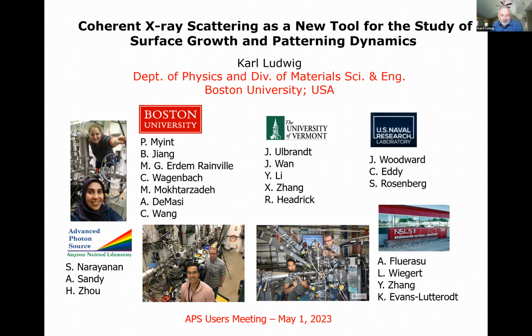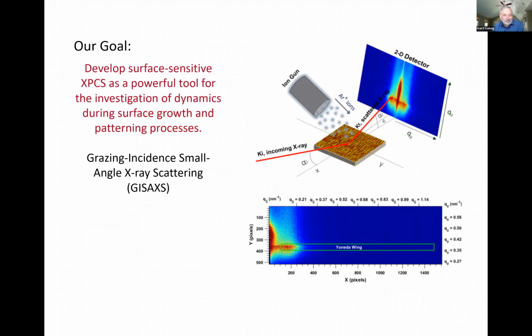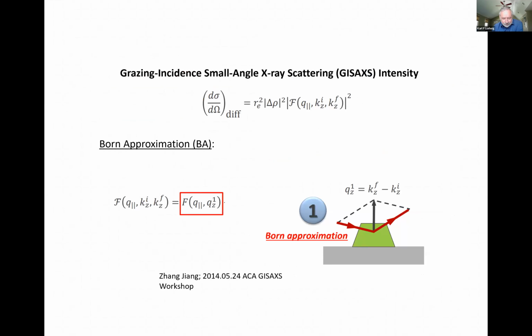We've also been collaborating closely on some of the work with a group at the Naval Research Lab. So a lot of people involved. Our goal has really been to develop surface-sensitive XPCS as a tool for investigation of dynamics during surface growth and patterning processes, focusing largely on GISAXS geometry.